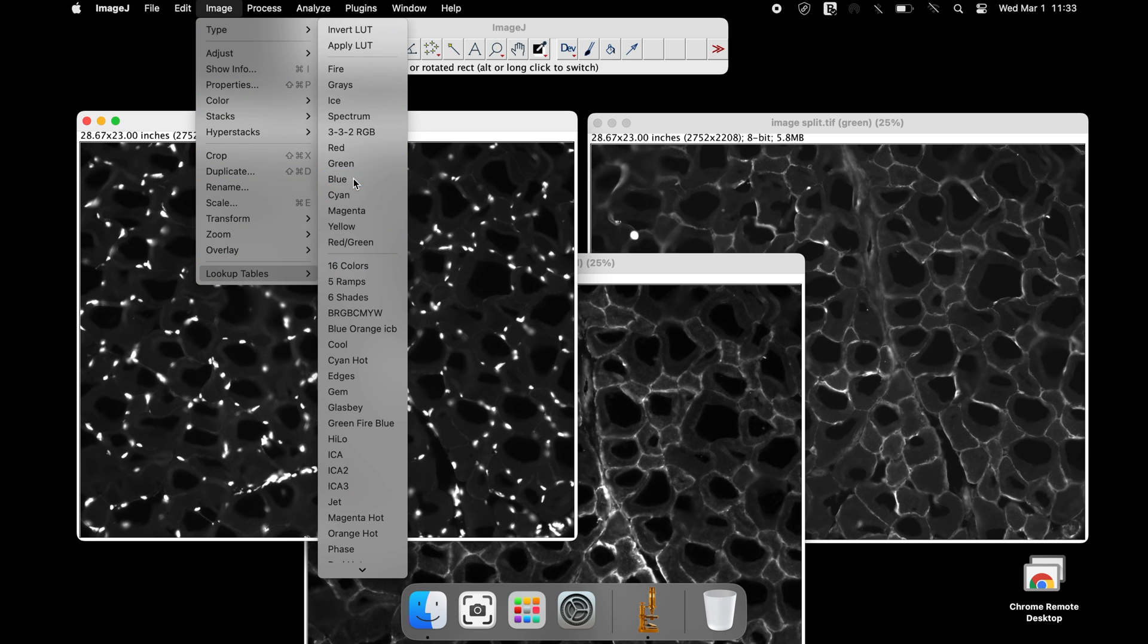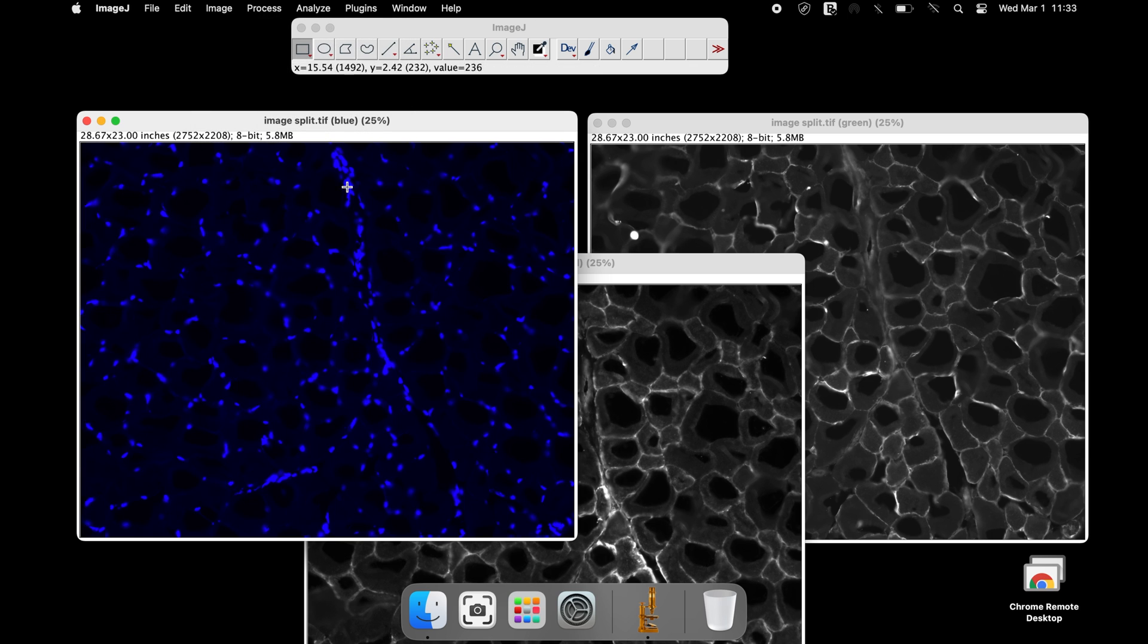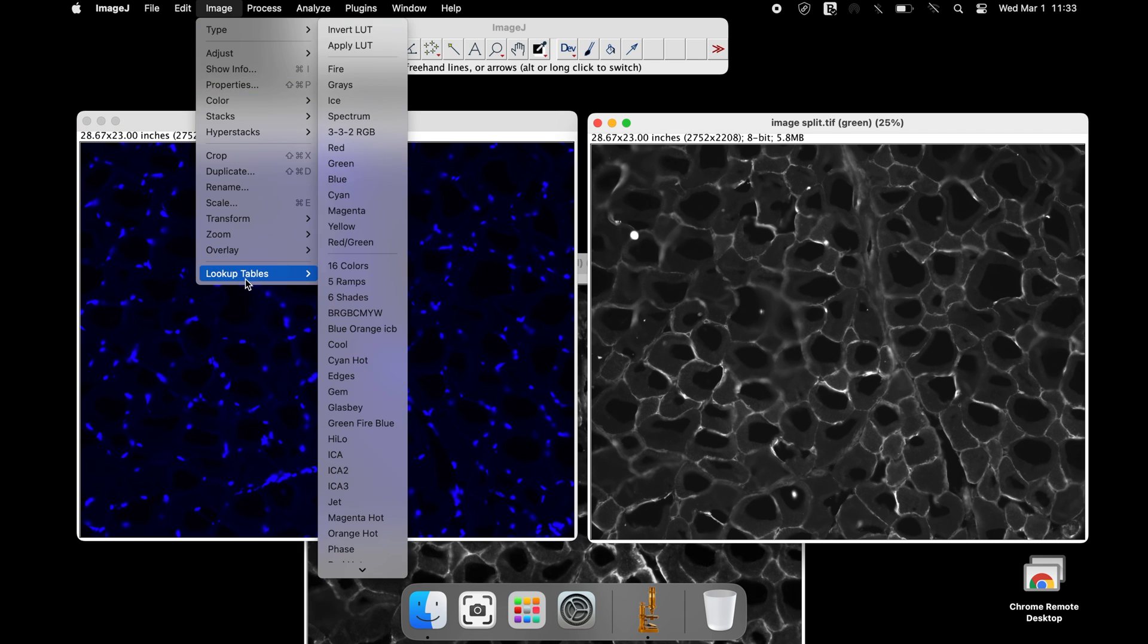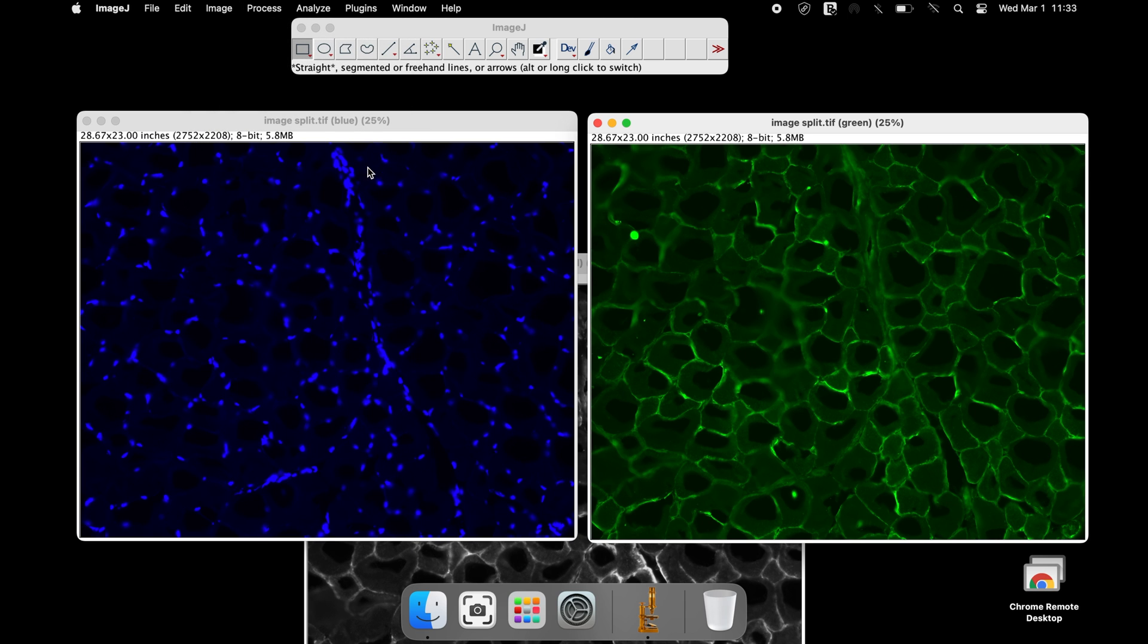Select the color blue for the DAPI staining. Similarly, the other channel colors can be applied to the remaining images.